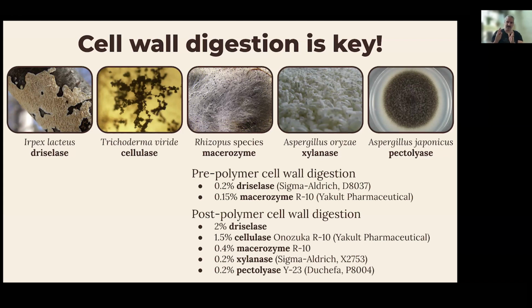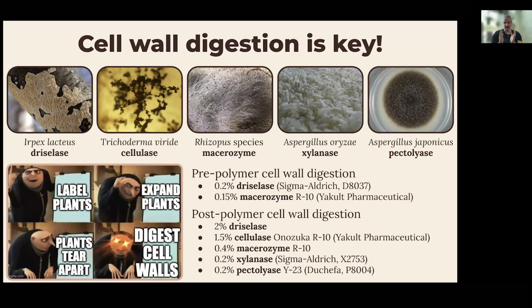So this is indeed a common theme in expansion microscopy. Anytime you apply the technology to a different sample, you need to find the correct homogenization conditions, which typically just means you need to find the correct mixture of enzymes and heat, and then you can expand almost anything. So, lesson to take away: you need the homogenization, the digestion with the enzymes, to actually expand your plant cells.